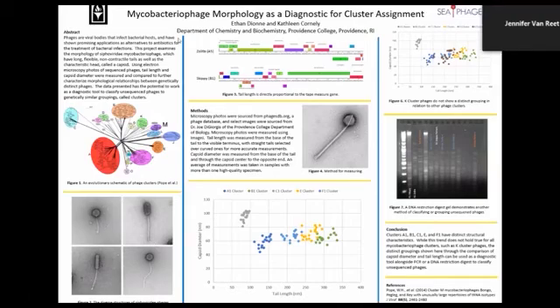Is there any relationship between the tail length and the other measurements you're taking with how many organisms that phage can infect? So what you're talking about, the K phages are more broad and the other ones are more narrow?